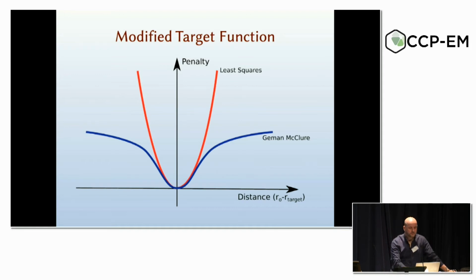target values. So if you were having a least squares competition between a model that was this distance apart and this distance apart, then there would be an enormous penalty for the structure that was further displaced from the ideal value. We're not paying that penalty anymore, so we can have conserved or consistent deviations of distance with this weighting scheme.